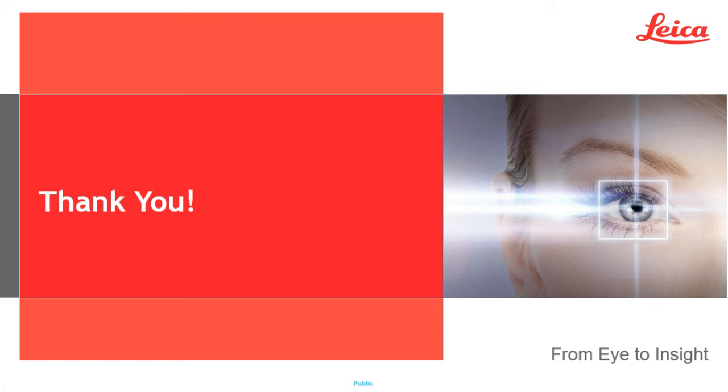Thank you so much, Dr. Tran. And again, I want to thank our audience for these great questions coming in. Our next audience member asks, does a random forest algorithm only look at single pixel information or also, for example, the neighborhood or whole object size?